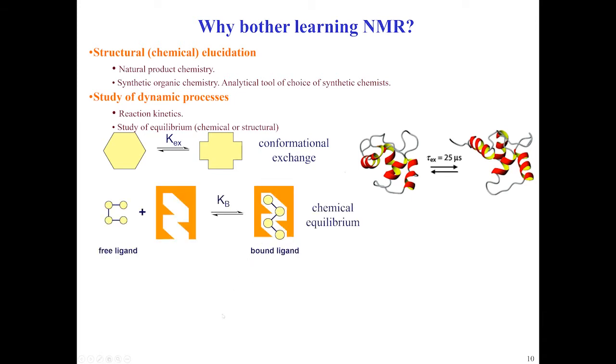Then along these lines, you have a ligand that would bind to a binding site of a given protein, and consider nowadays we're working a lot with COVID and trying to find cures. So this is a way to do it. So try to understand how a given compound that might be a drug will bind there. Then a little example of an amide. You see that position of red and green methyl group. Of course, they're not red and green in the NMR sample, but a different position will come up and we'll be able to understand this process. And this is important, believe me.